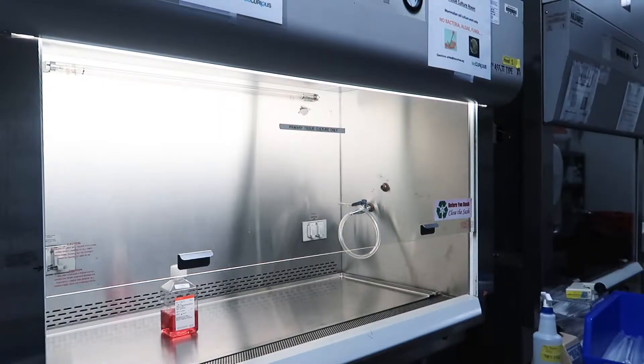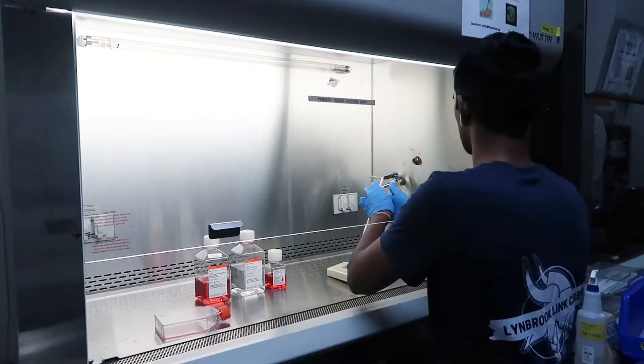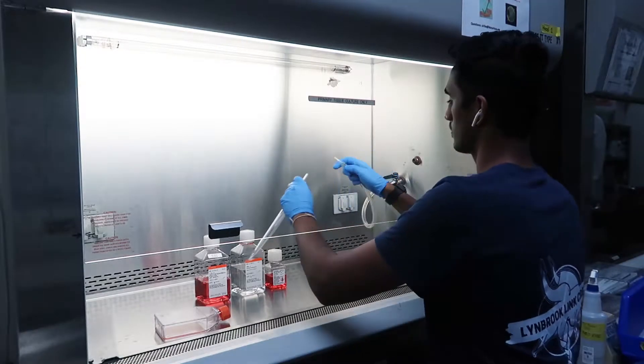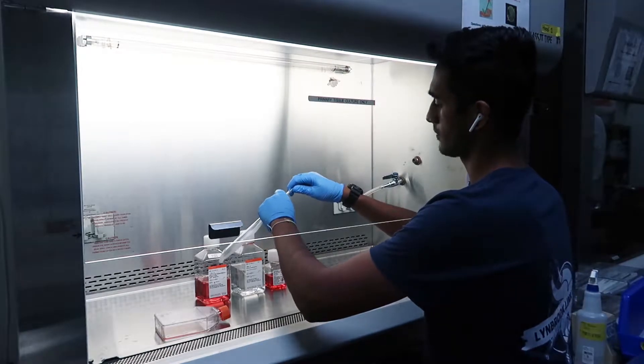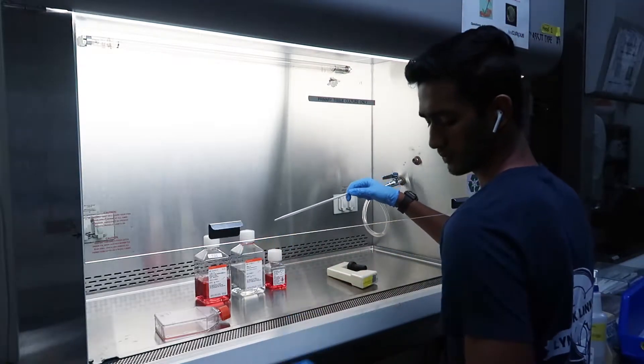Now before you start, your PBS, medium and trypsin EDTA should have been stored in a fridge. To make sure you don't shock your cells, make sure that you heat them to room temperature either using a water bath or leaving them out.